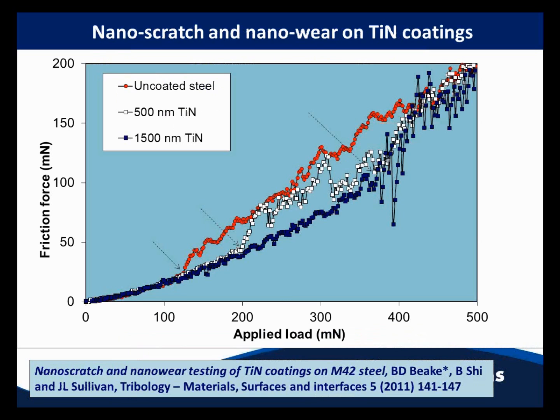Moving on now to a harder coating. In a nano-scratch test, what's particularly useful from an instrumentation point of view is to design an instrumentation with a high lateral rigidity in its loading head. It allows you therefore to test rough samples without your data being unduly affected by this high roughness.